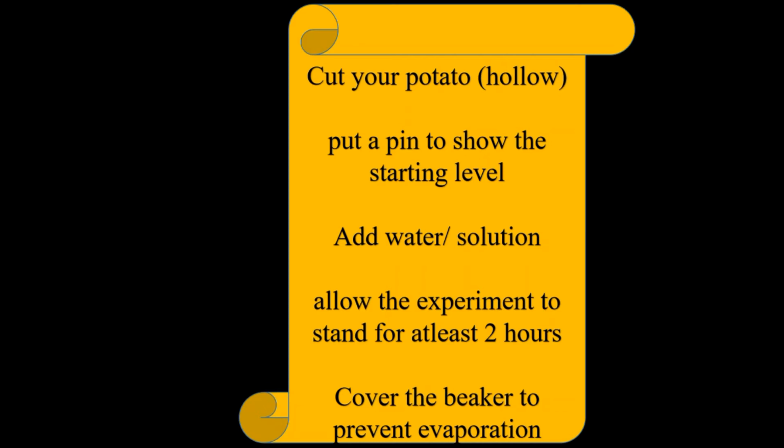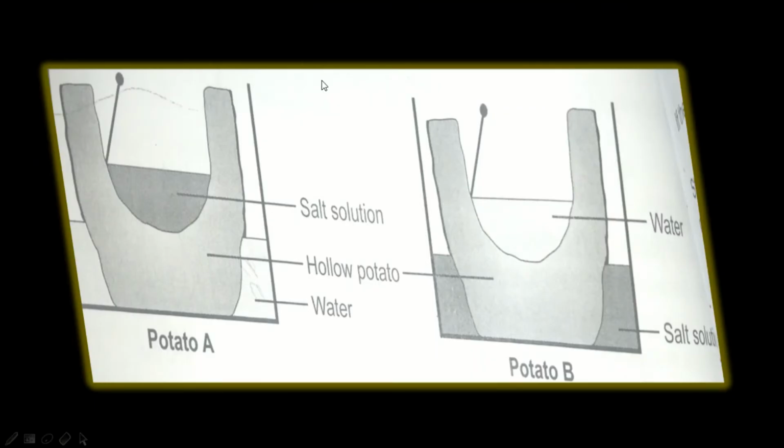All right, and then we are also told that we should always remember to cover the beaker to prevent the process of evaporation. We don't want our experiment to be affected by any other environmental condition.